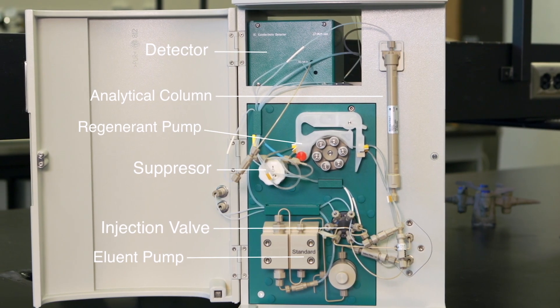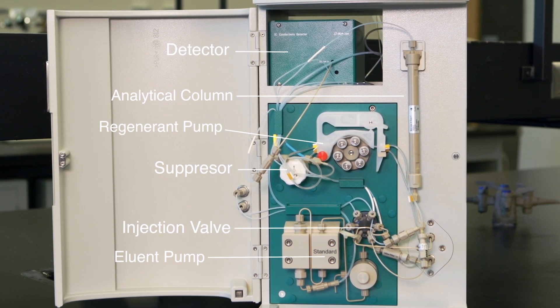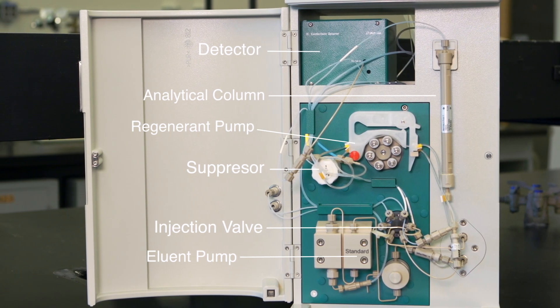The ion chromatograph consists of an eluent pumping system, injection port, column, suppressor, and detector system.